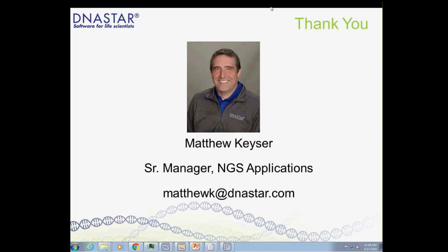But we'll start with a few questions about the de novo transcriptome assembly step. And so one question was, how were the 561 novel transcripts discovered during the assembly?